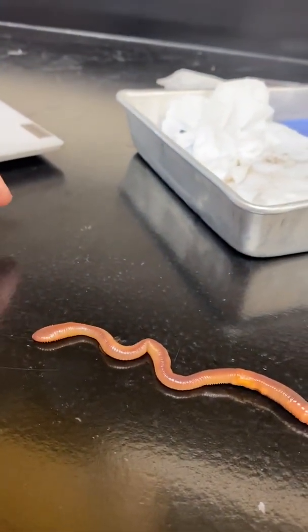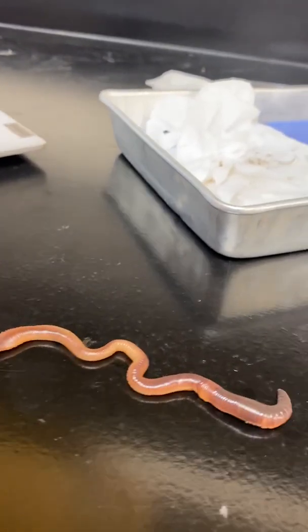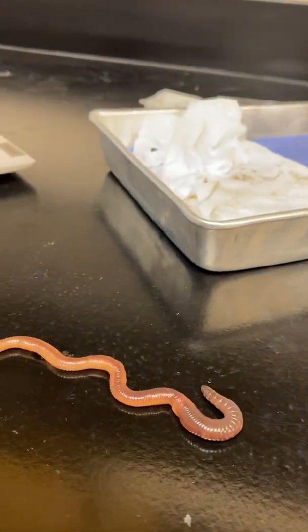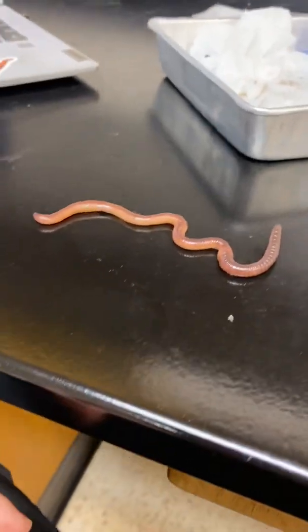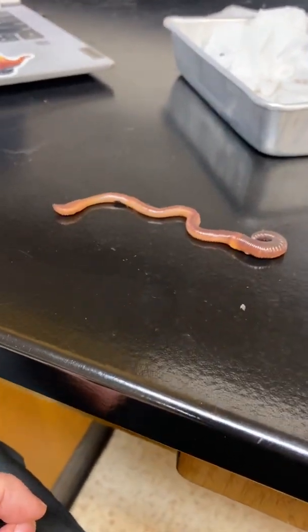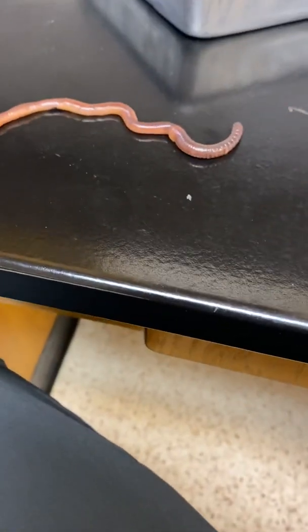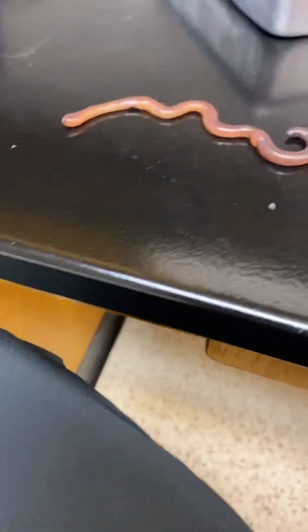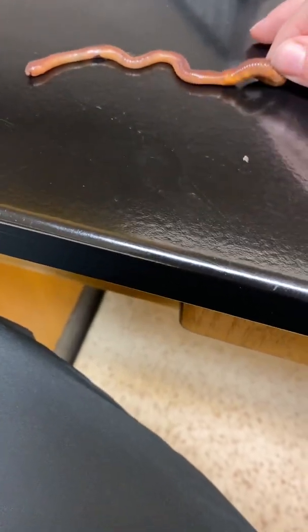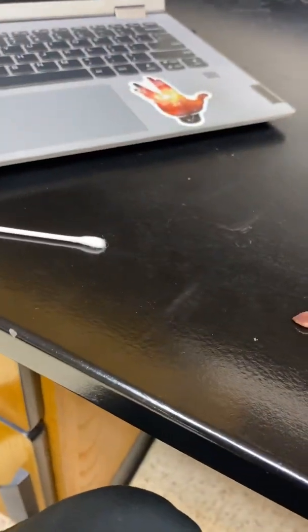13, observe and compare the movement of the earthworm across a spread out paper towel on the table to the movement of the worm on the surface of the table. Describe how a smooth surface affects this movement. So it's not moving a whole bunch, but it seems to move quicker on this flat, more smooth surface. I thought it wouldn't be able to move as much because the setae can't really grip. But I think what's happening is that the setae on the paper towel is gripping, and so it's not moving as quickly.